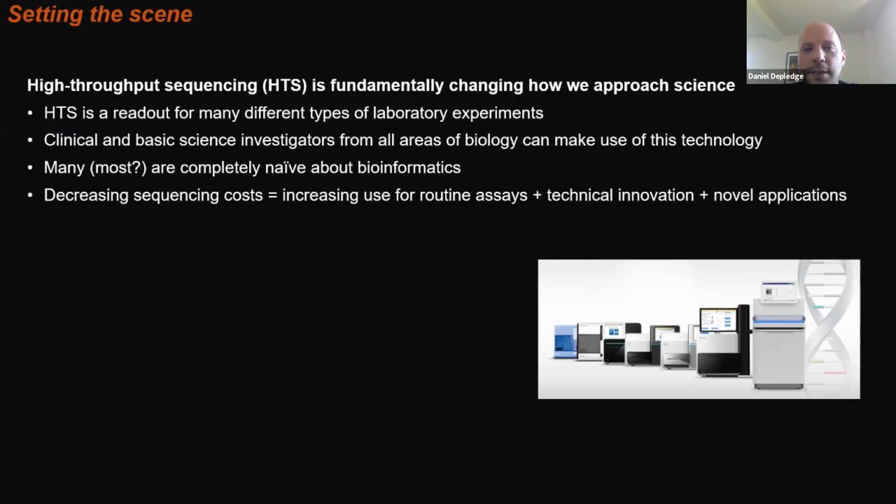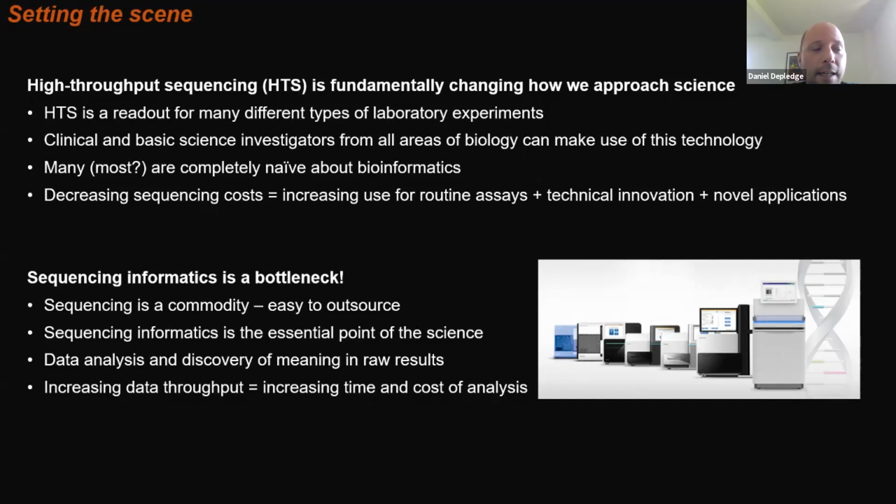We're also faced with the good thing, which is that sequencing costs are coming down dramatically, which now means that there's increased use in routine assays. There's a lot more technical innovation and a lot more novel applications going on in this field. All of this raises additional challenges, the most of which is that sequencing informatics has very much become a bottleneck.